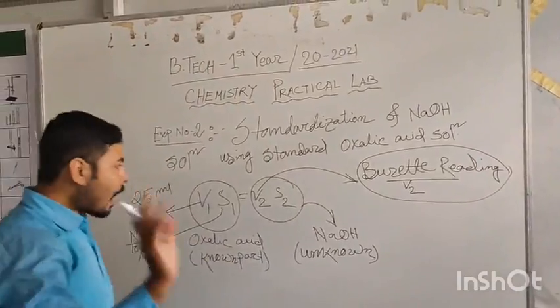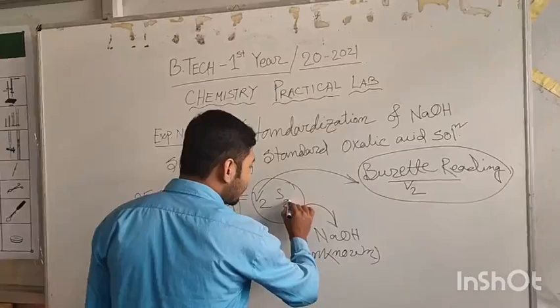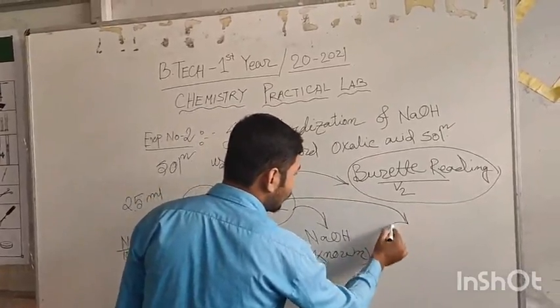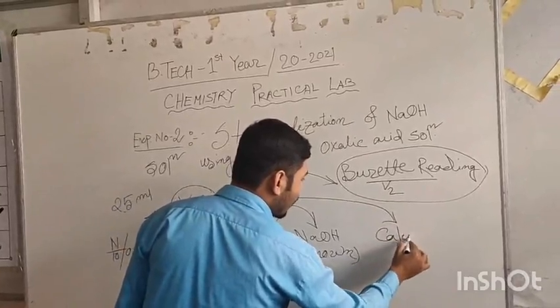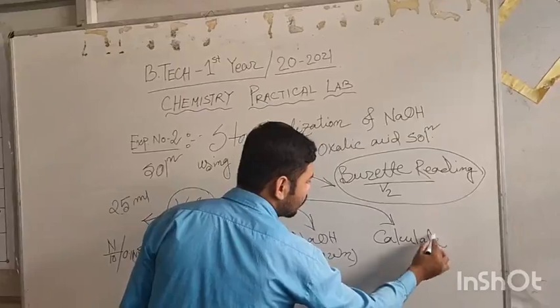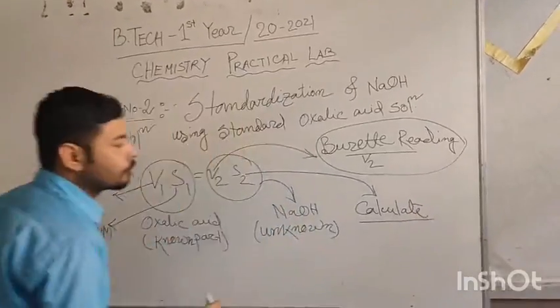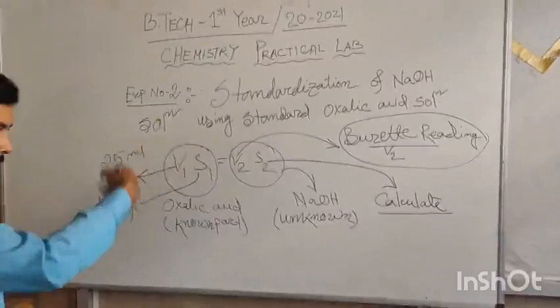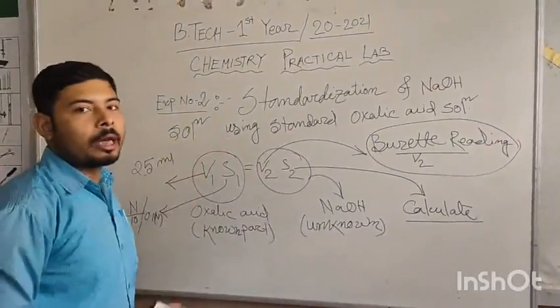Clear? Now you have to calculate this S2. So in this way the whole experiment will be done.